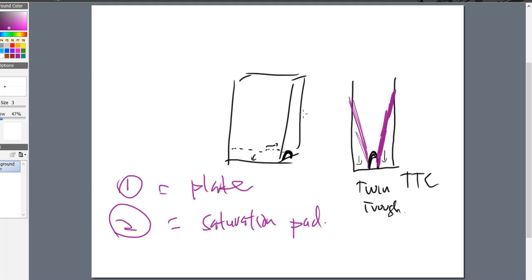All right, your automated tank developer chamber is going to operate in a slightly different way. Those plates are going to dangle. As it lowers the plate down into the tank, it's going to hold it upright, and that's just the way that it's going to be held. It is what it is. That's the way that it's going to perform its job. There's nothing wrong with that. It's not leaning, and it actually might give me better data because of that. And it's not touching the surface of the glass tank at all, anywhere, on the bottom or on the sides.